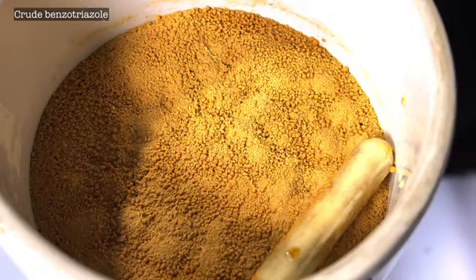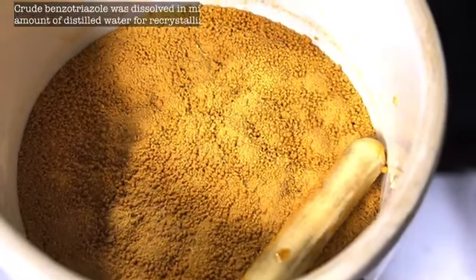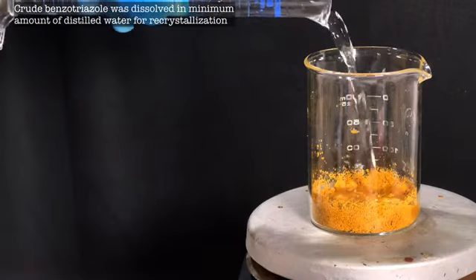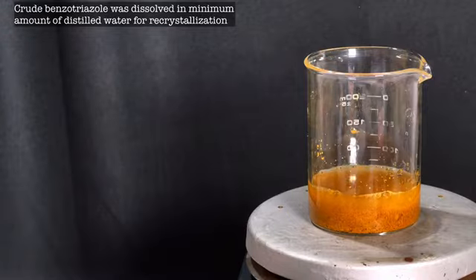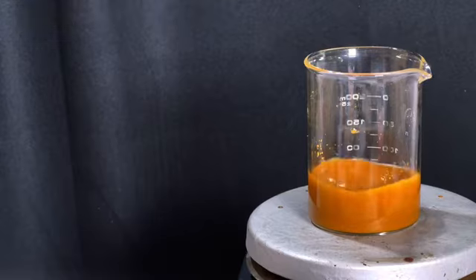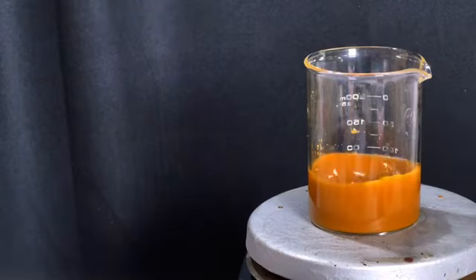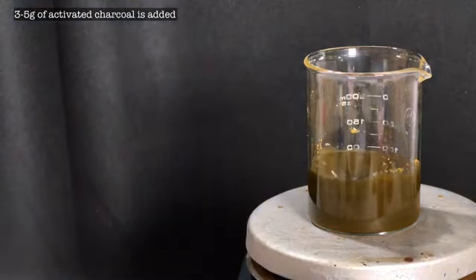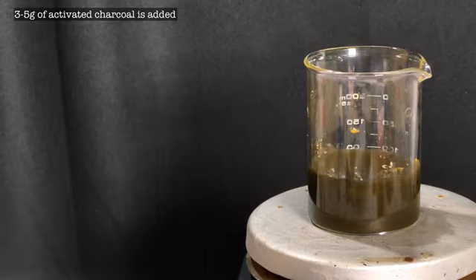Next, we proceed to recrystallization and purification of the crude product. For that, the crude product was transferred to a 250 milliliter beaker. A minimum amount of water was added and the mixture was heated. Around 3 to 5 grams of activated charcoal was also added to the mixture. The mixture was then heated for 15 minutes and then it was filtered while still hot.